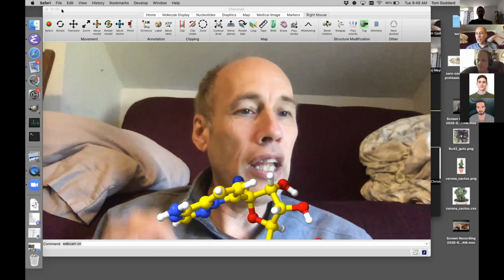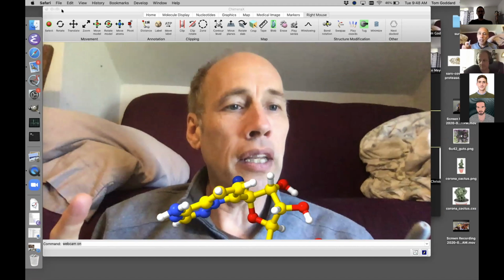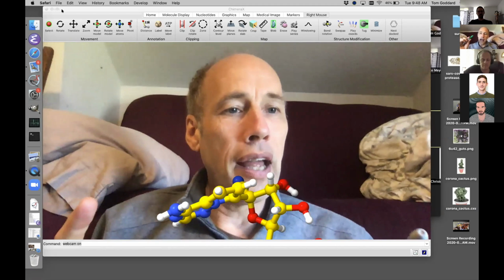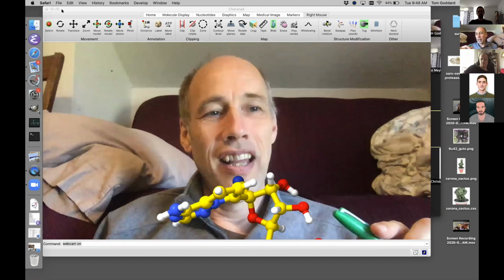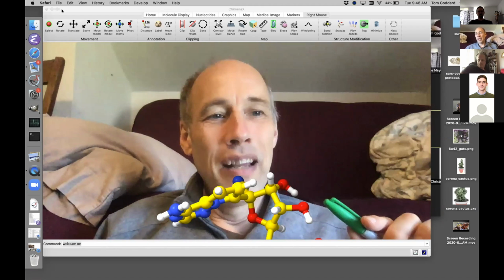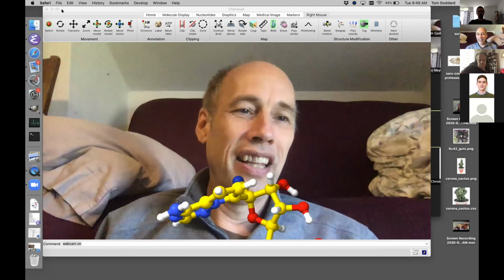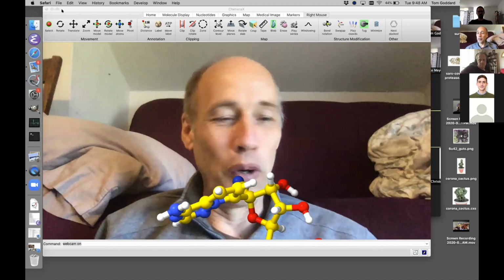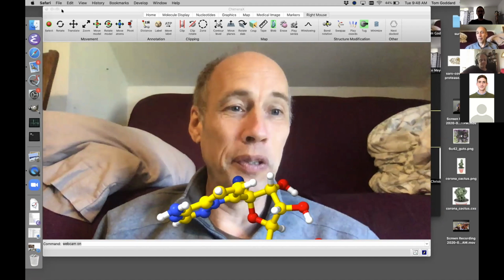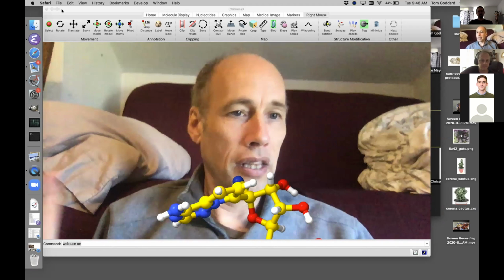If you try it and it doesn't work, you might go to ChimeraX Help, Report a Bug, because it will say what format your camera was trying to use. If you report that to me, that will alert me that some cameras use this other format, and I need to add a little support for that format too. But right now, just Mac laptops, I think. At least that's all I've tested.